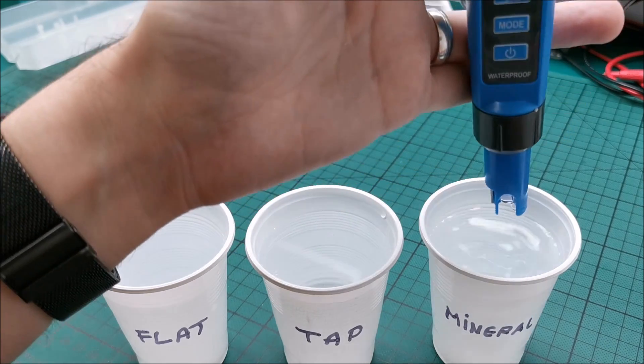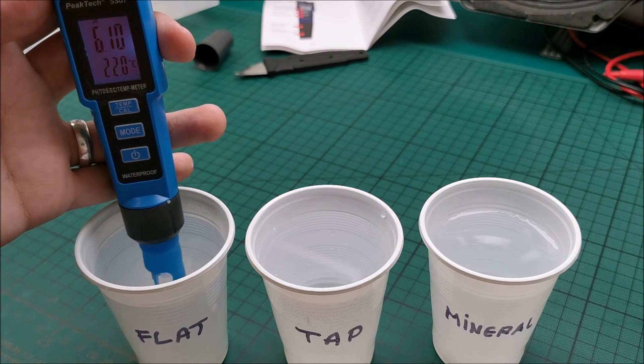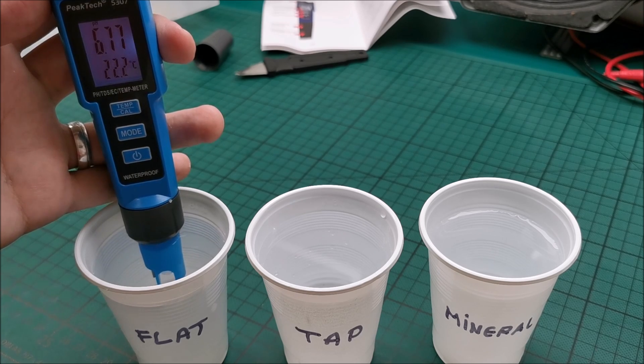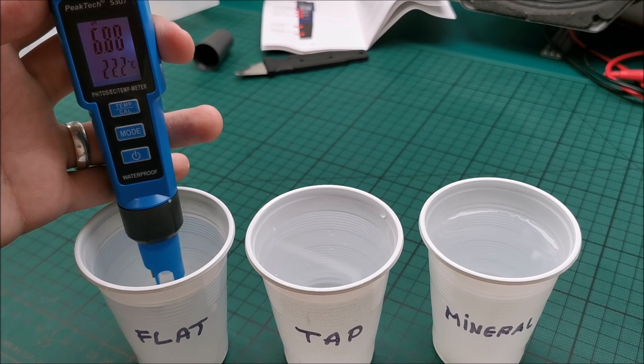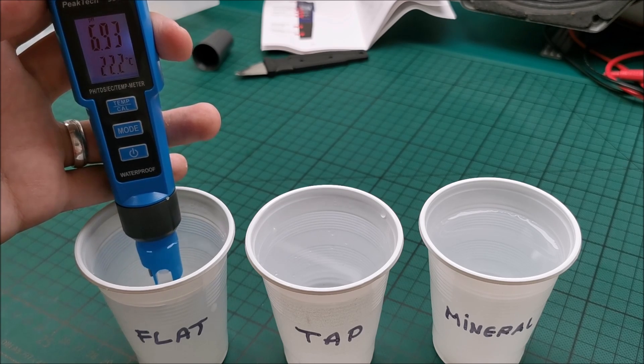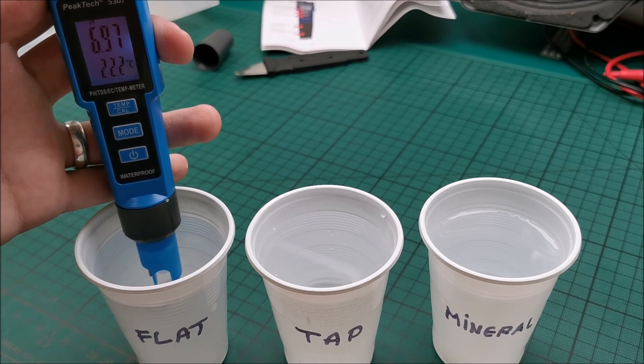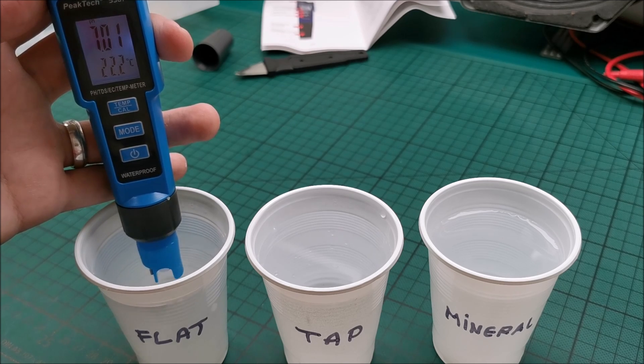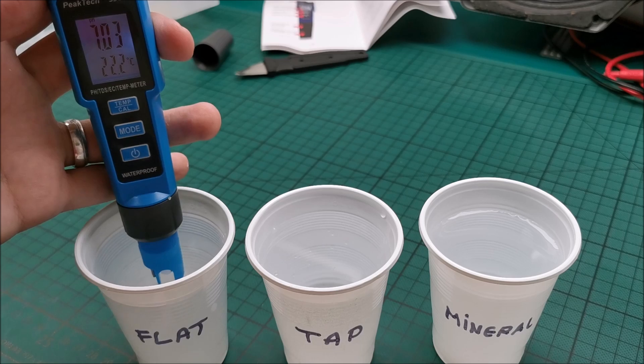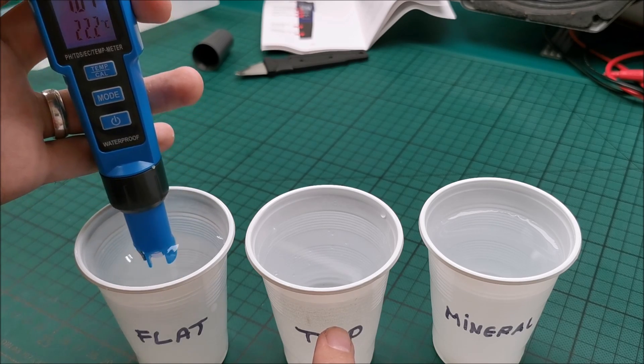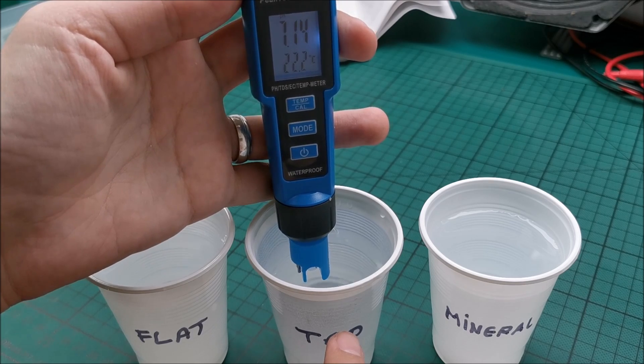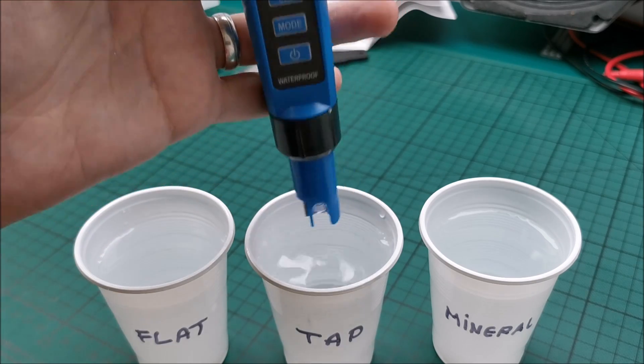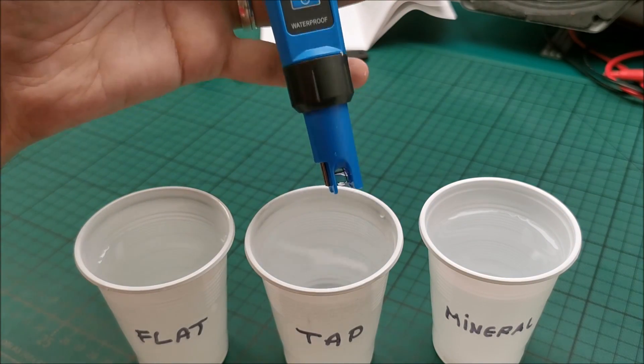Probe needs to go in maximum up to this level, so don't put it more. And I was right, the mineral water is clearly more acidic. Yeah, I love it when I'm right, it's absolutely clear that it's more acidic. Let's go back to the one that I drink which is the closest one to being neutral and you can see it growing. So now I can tell my father for a fact that the water that he drinks and my mother also, they both drink it, is a bit acidic and not ideal for his stomach acid.